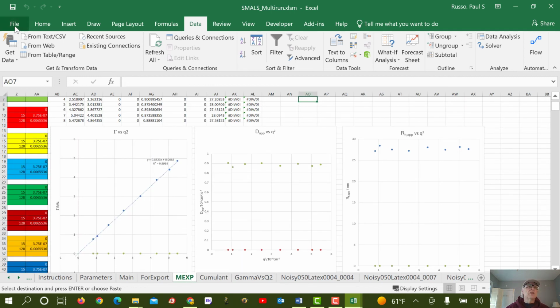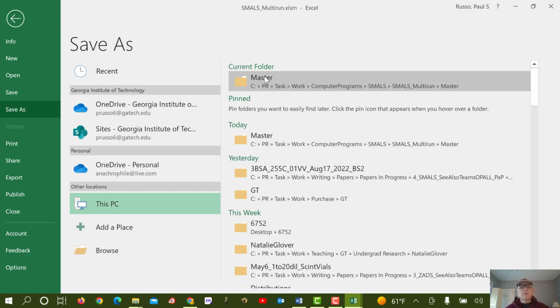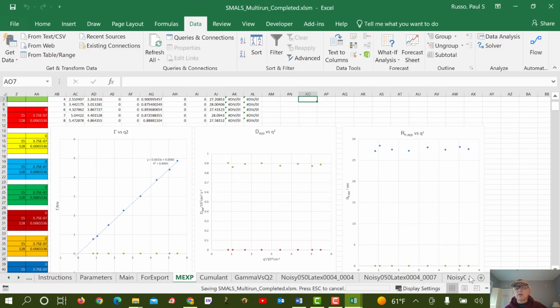I like to say that: something. So let's call it multi-run completed. And that should be the end of the video, I think.